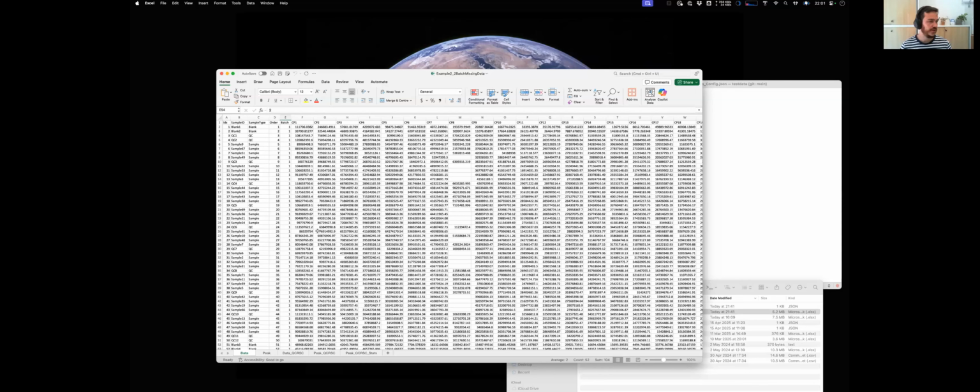So maybe the last question from the Q&A session. Actually, it's 2 questions in one, but I think you already answered the first part. The second part is also something I was curious about. When you create your QC, if you have a very large number of samples, maybe this dilution effect for the different features might be more relevant if you have more samples, right? So the question is basically, is there a limit on the number of samples for a pooled QC? This is a question from William. If I misunderstood it, you may ask it again, but that's how I take it.